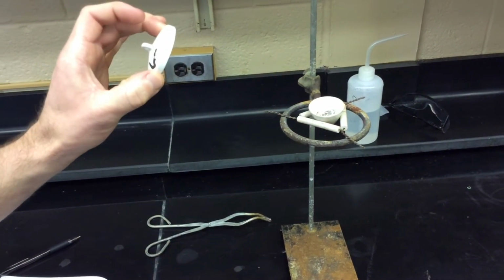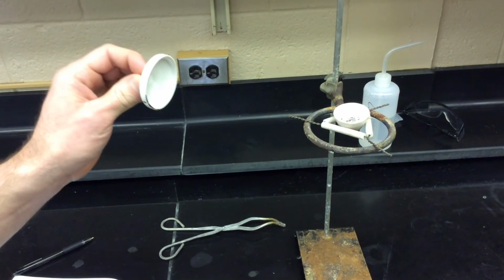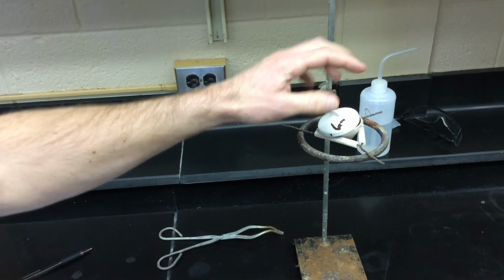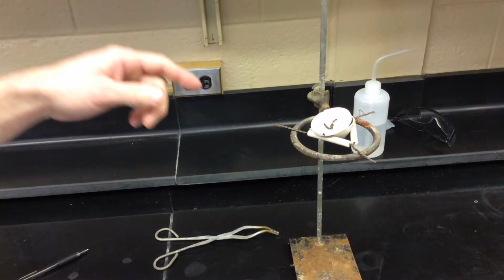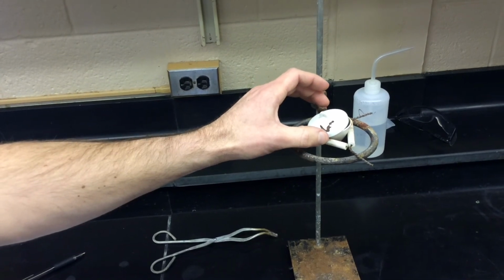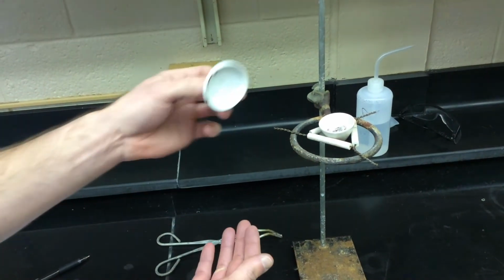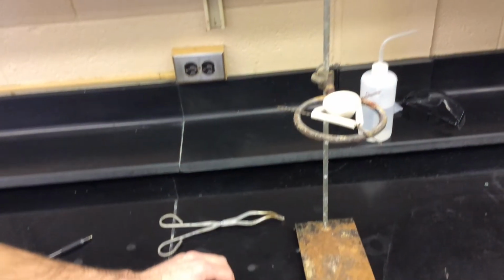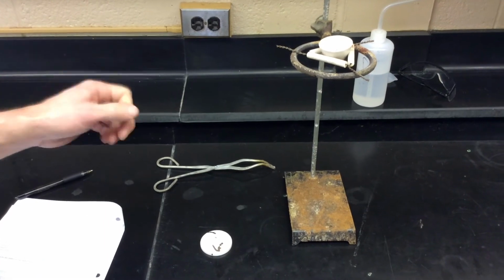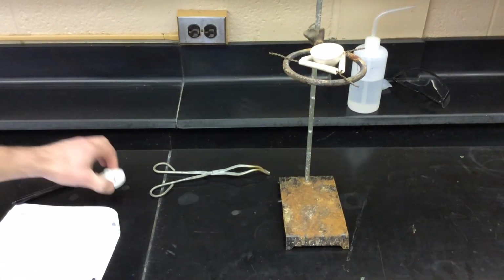The reason I don't want to is really for a safety reason. I've found over the years that if people get burned during this lab, most of the time it's because of the lid. For one thing, you have to leave it half on and half off, so water molecules can actually leave the crucible. You kind of have it positioned there, and sometimes it slides off. What I have actually seen people do is not really think, and as it's sliding off, they try to catch it and burn their hands. Or if it slides off, it falls down and cracks, and pieces go everywhere. Usually when something falls and breaks, people's immediate reaction is to start picking up the pieces. So I've had more people get burned from the lids than anything else. And since we don't really need them, that's why I'm leaving them off.